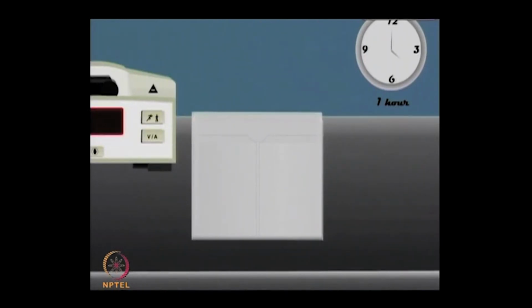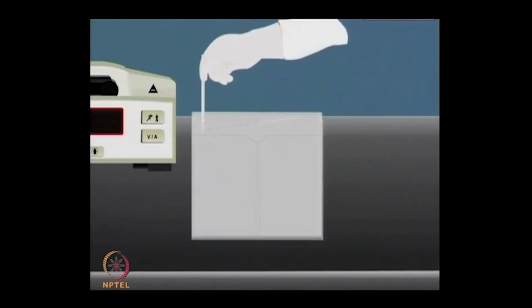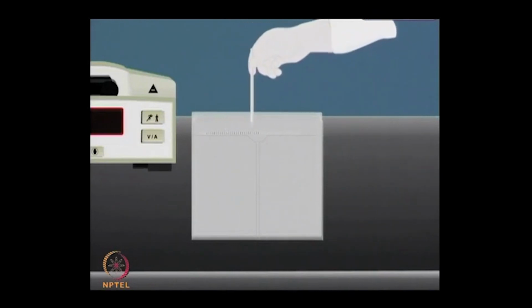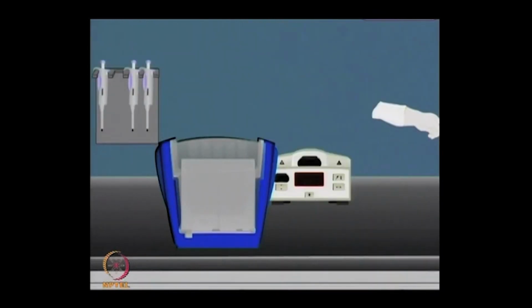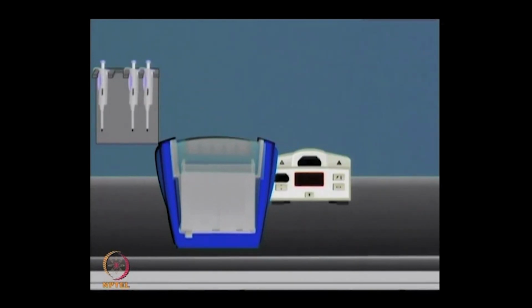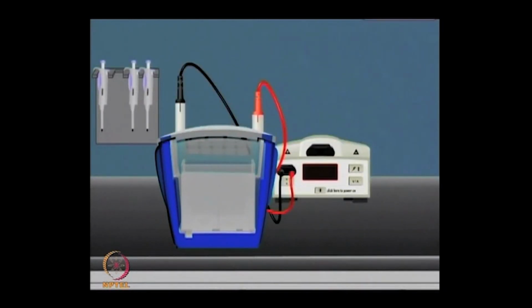So, prepare the gel casting solution consisting of acrylamide, bisacrylamide, Tris-chloride, SDS, APS and TEMED. Once the gel is polymerized, then you can add the IPG strip, and now ensure that the assembly is properly sealed and buffers are properly placed, so that proteins can be separated based on their molecular weight.